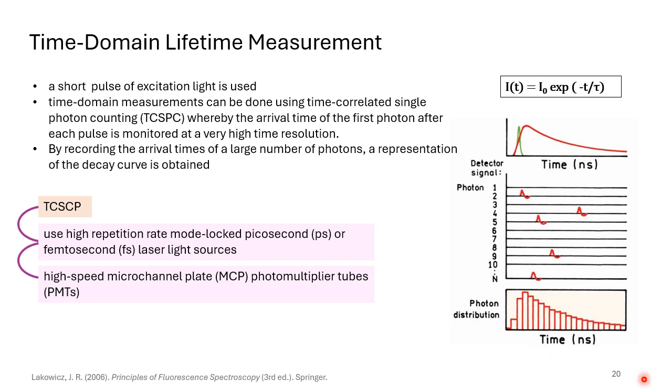Or we can also calculate the lifetime from the time at which the intensity decreases to 1/e of the starting intensity.